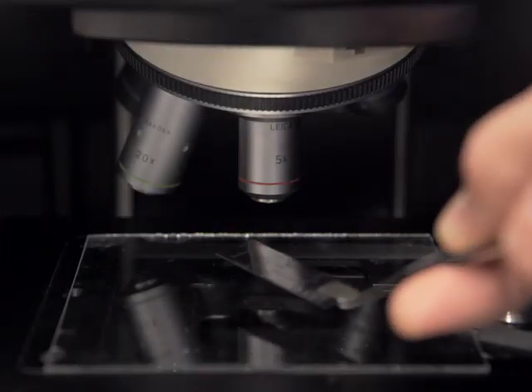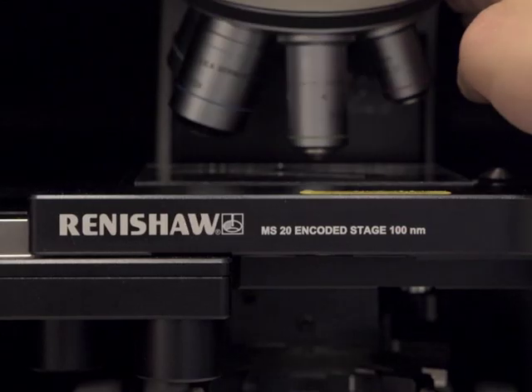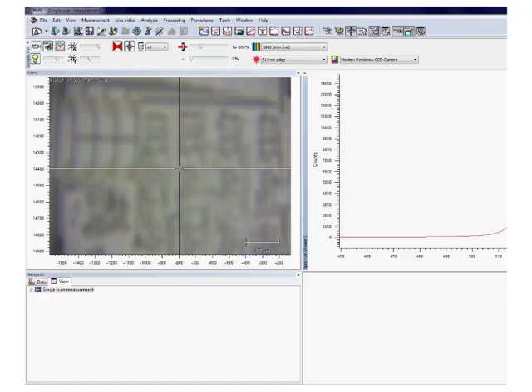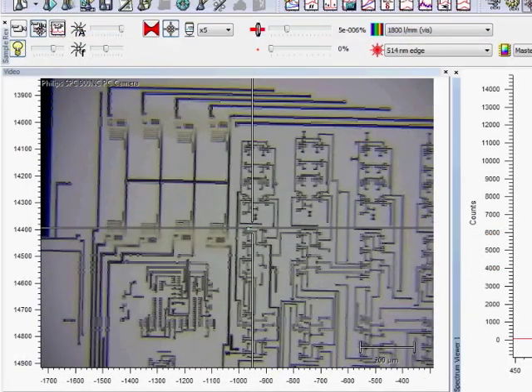Once calibrated, place the sample underneath the microscope and focus on the layer of interest. A dark enclosure is used to remove stray light. Make sure the path of the laser is not obstructed by light-absorbing or Raman-active layers so as to obtain a clean spectrum.